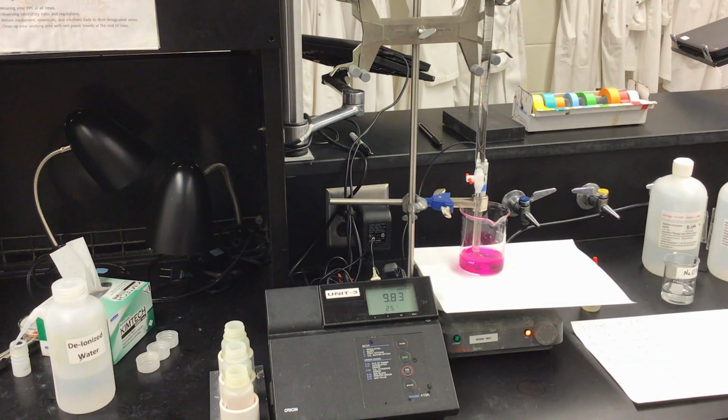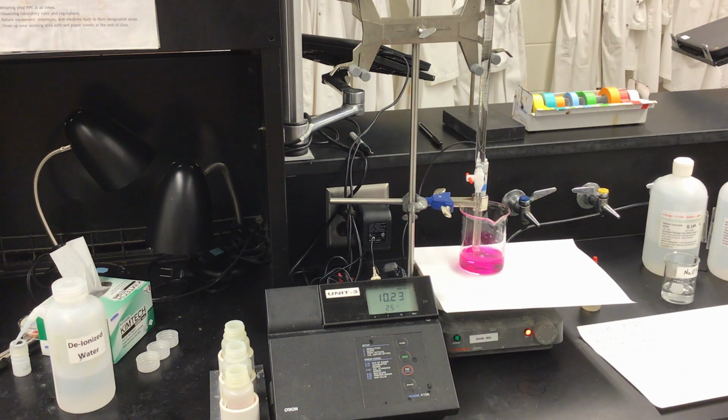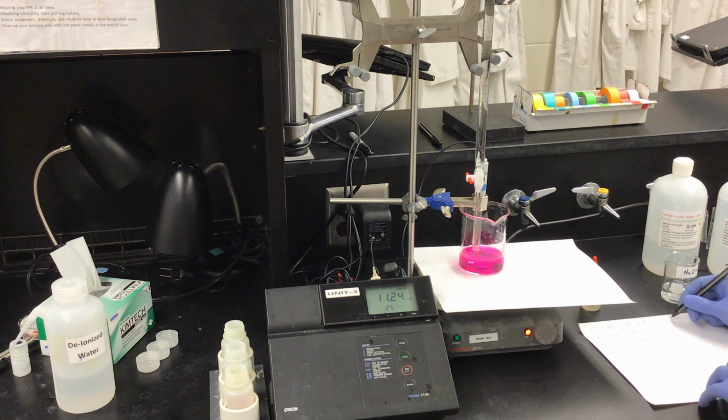So now I have added another 2 milliliters. As you can see, my indicator is a very deep pink. This shows that we have over titrated the solution. You can see that our pH now is reading above 10, so we are now very basic. Now at 29 milliliters of sodium hydroxide added, we are at a pH of 11.23. We will see if that is our final pH, 11.24.